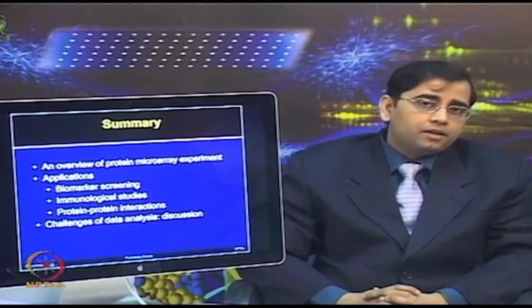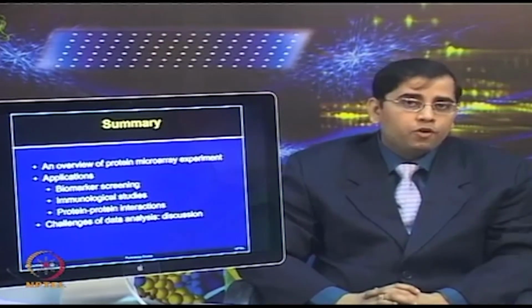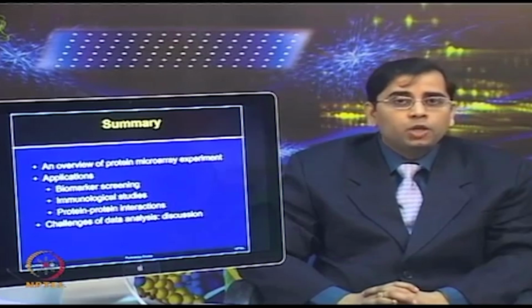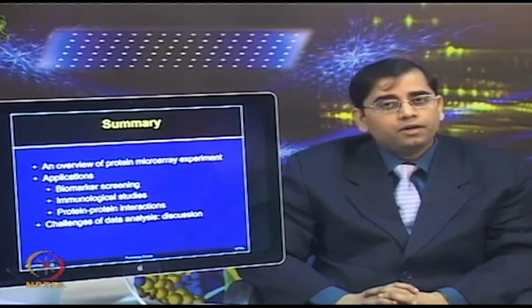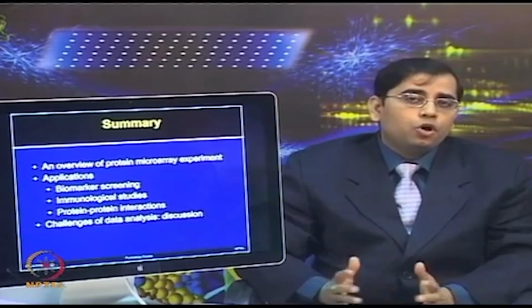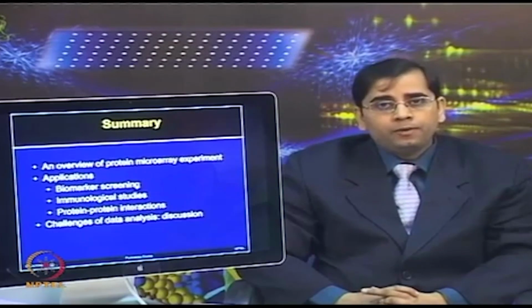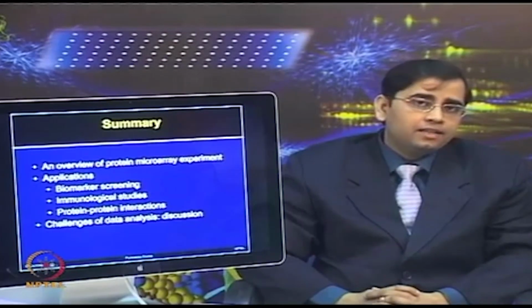In today's lecture, I gave you an overview of the steps involved in performing a protein microarray experiment, whether you want to do protein interaction or any type of disease screening. One has to go through all those steps. Then we looked at different types of applications in different case studies.